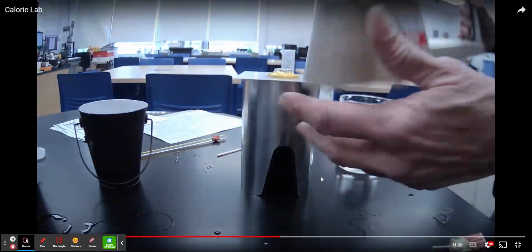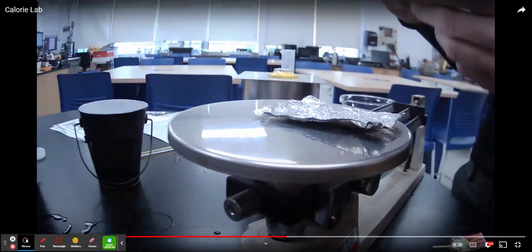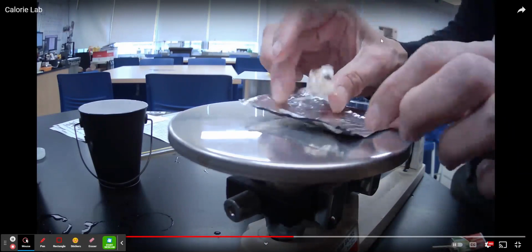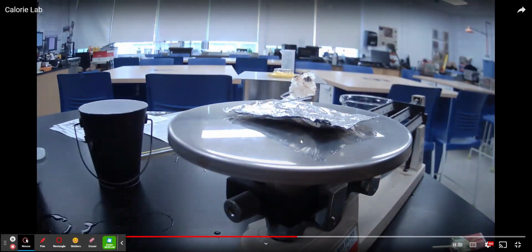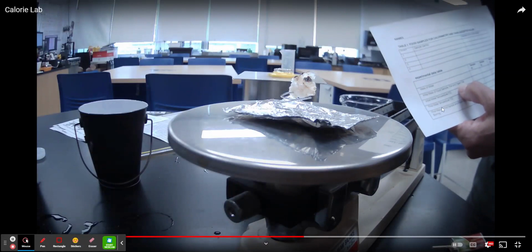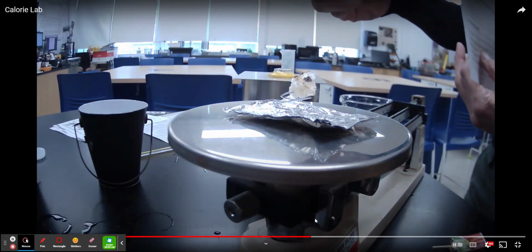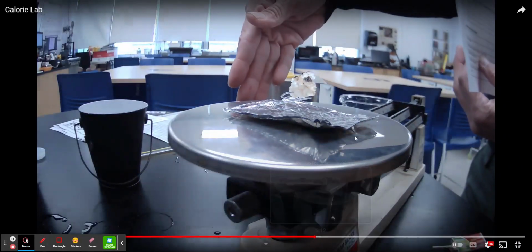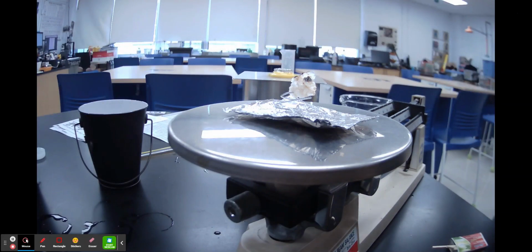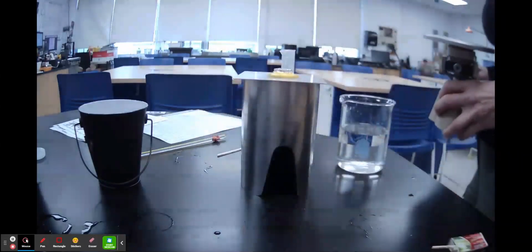Then you're going to mass the foil, paper clip, and food sample. It's better to put the food sample on the paper clip first, so if a piece falls off, you're not weighing that. The reason for the aluminum foil is to catch any pieces that fall off during burning. And then you're going to record, in the second row, the mass of the paper clip, aluminum foil, and food sample unburned. With that foil, make sure that you don't have any experimental error of a piece falling off and being in the combustion chamber, so that it appears that more of that food sample burned than actually did.